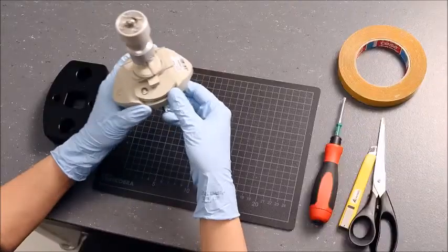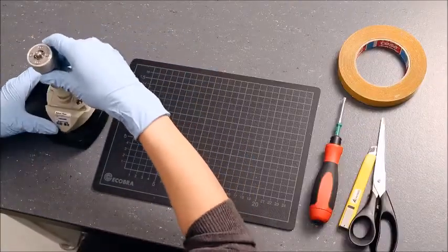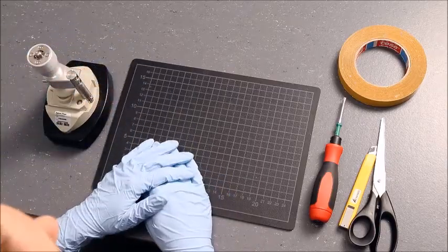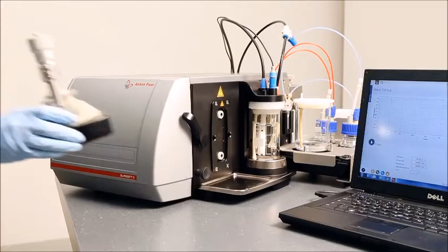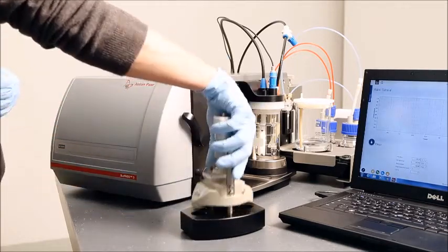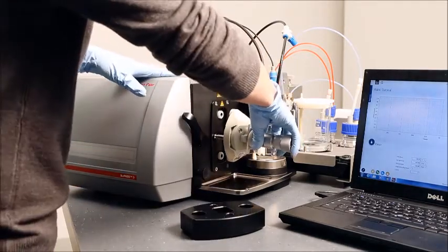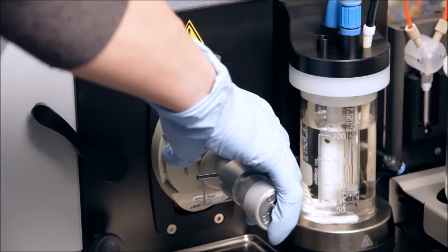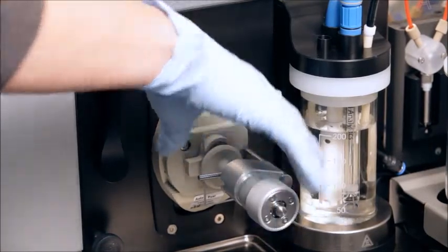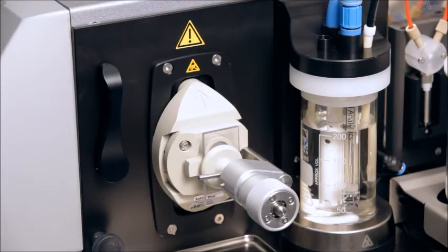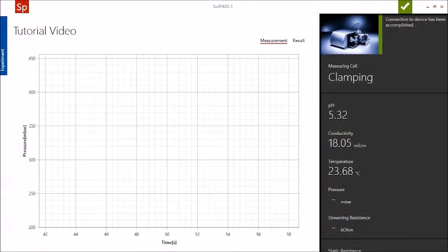Now you can mount the measuring cell on the instrument. Simply plug in the cell and lock it by turning the lever to an upright position. The clamping cell is then recognized by the SURPASS-3 software.